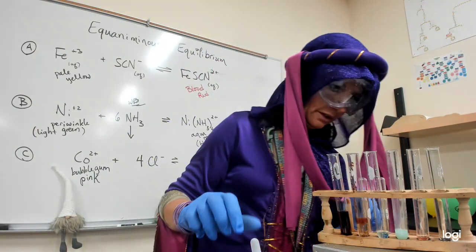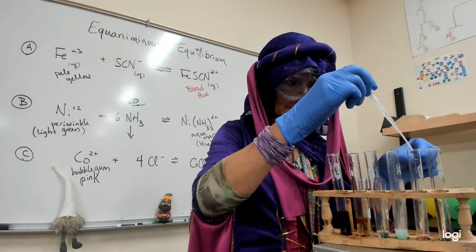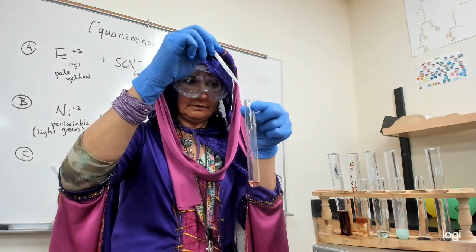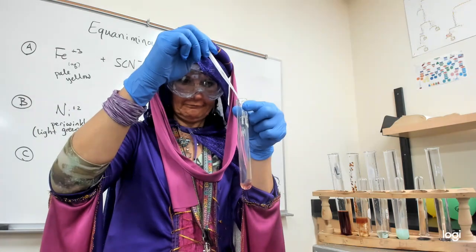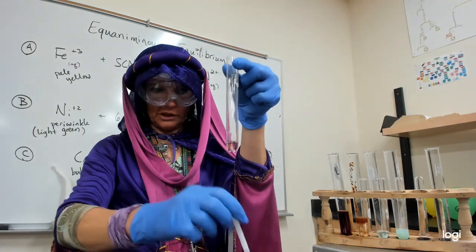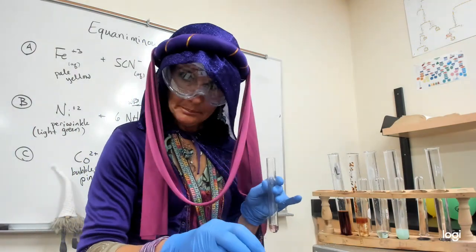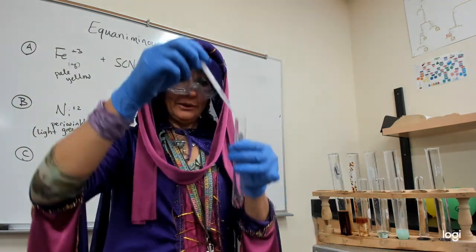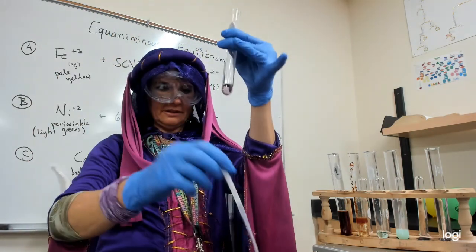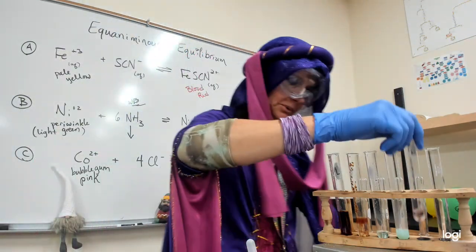All right. So, I'm going to add drops. This is like the big deal. Let's just add a bunch of drops. Well, nothing happened. I was getting a little confident. It kind of turned to purple. You might have to start over. Your teacher might have to follow instructions. It's definitely a purple now.